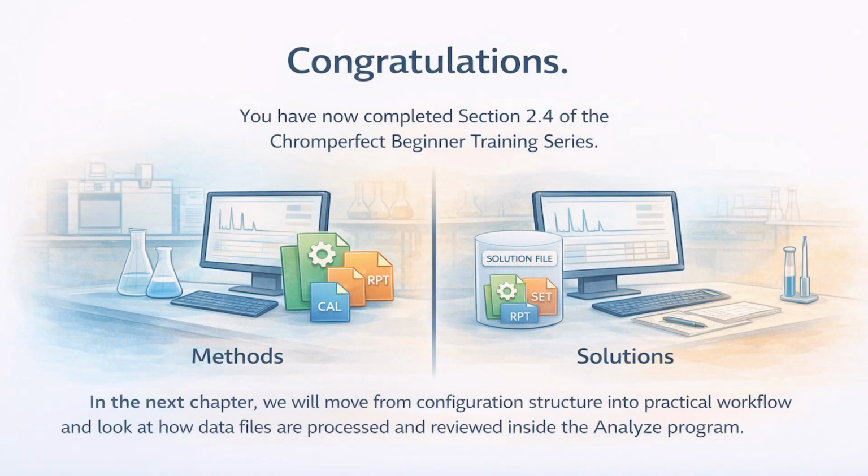Congratulations! You have now completed Section 2.4 of the Chromperfect Beginner Training Series. In the next chapter, we will move from configuration structure into practical workflow and look at how data files are processed and reviewed inside the Analyze program.